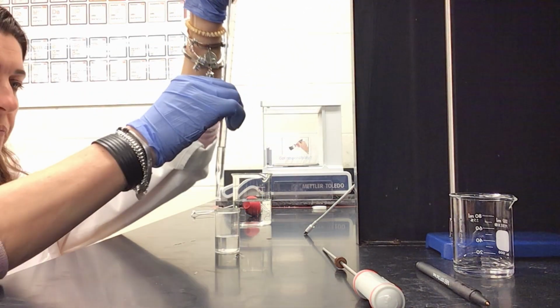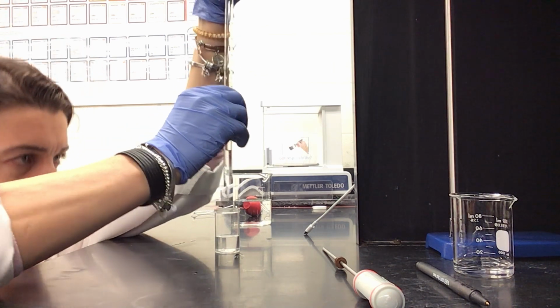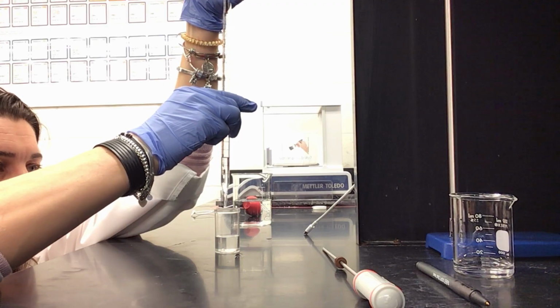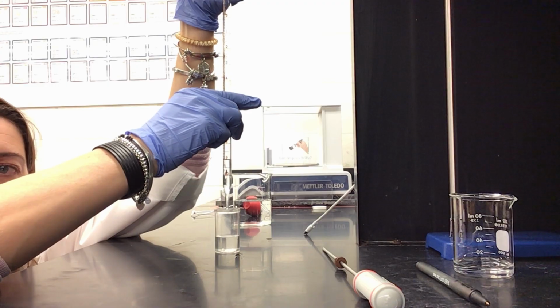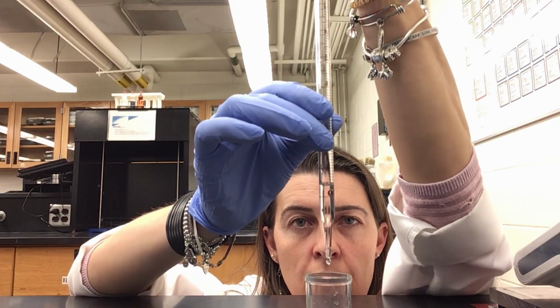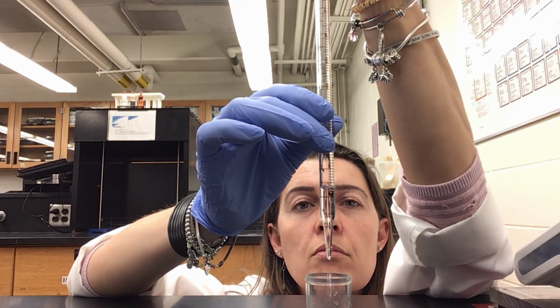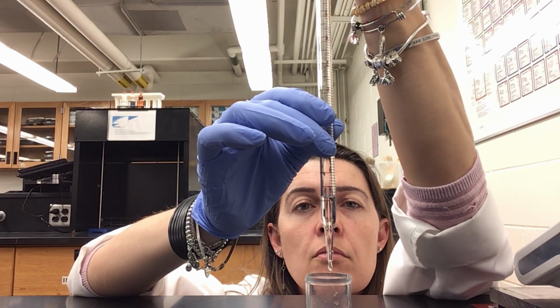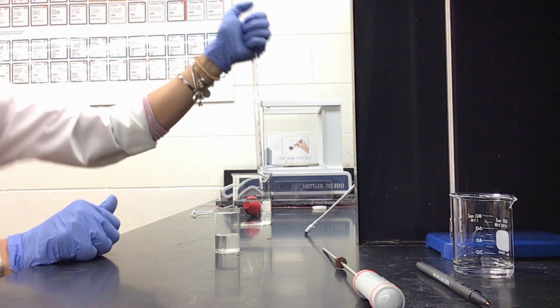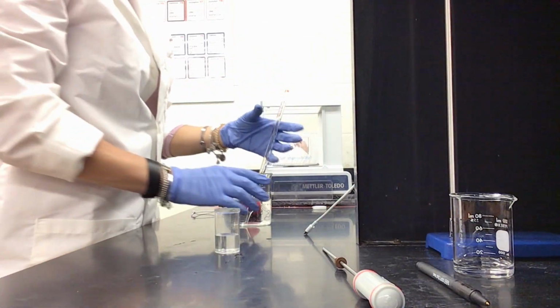okay, and let it go. I am gonna turn it so you can see the 10, hopefully. Done. And I'm gonna put the rest in the beaker.